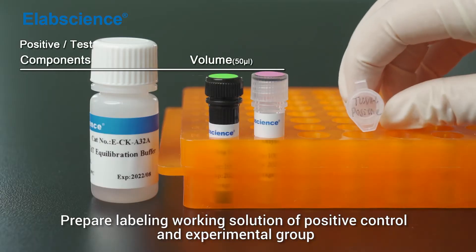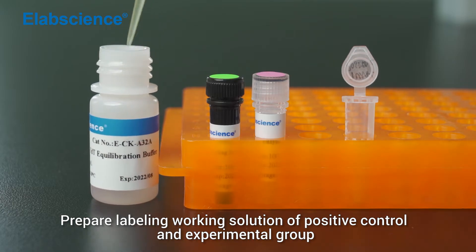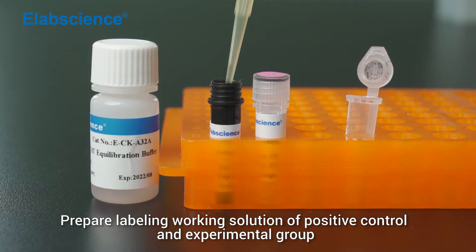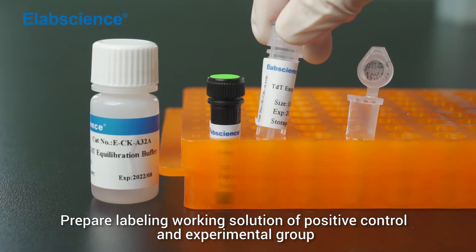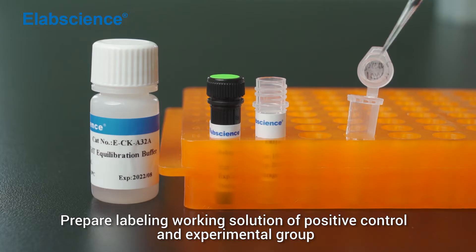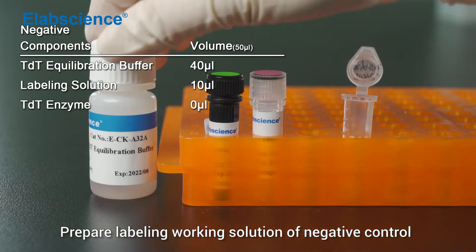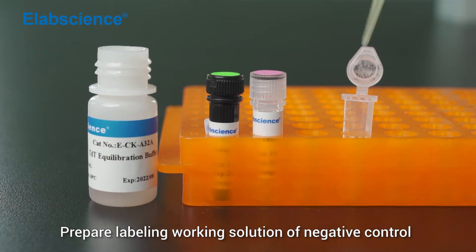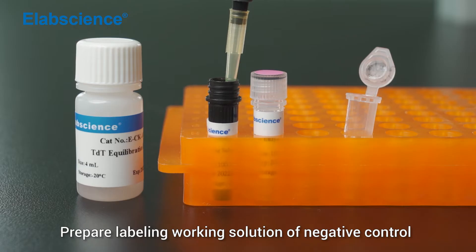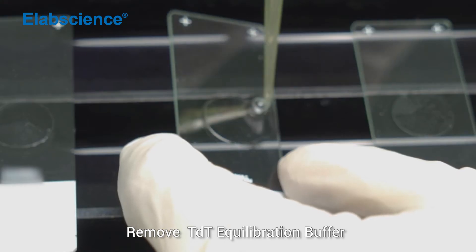Prepare labelling working solution of positive control and experimental group. Prepare labelling working solution of negative control. Mix. Remove TDT equilibration buffer.